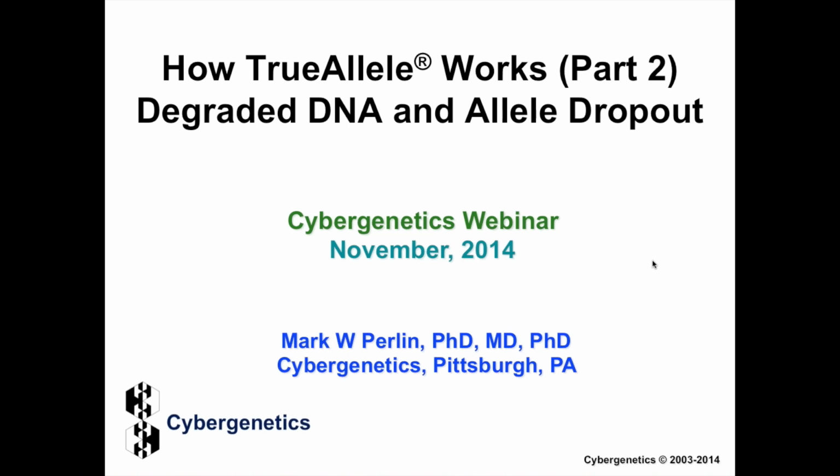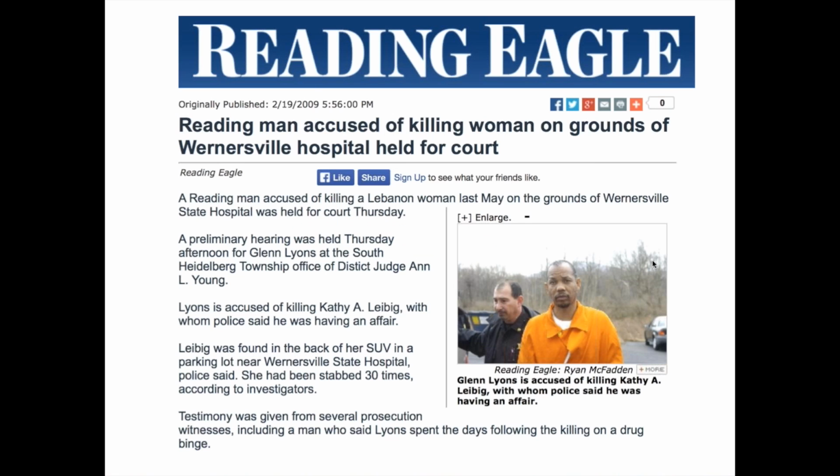Today we'll be talking about degraded DNA and allele dropout. Let's begin with degraded DNA.